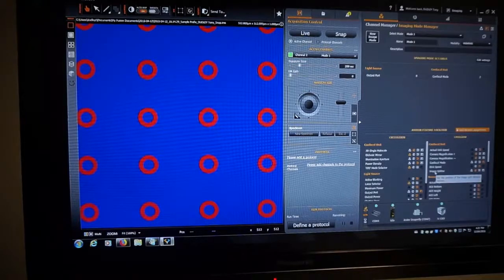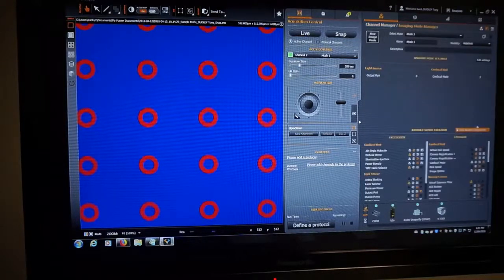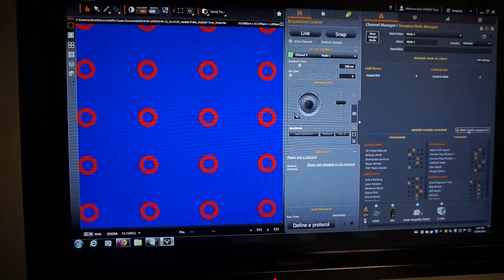And that will make sense when you go to actually set up a Dragonfly for the first time. The image splitter should be associated with a channel because the channel also tells you which camera is part of it as well. Okay, so when you create those default channels, it gives you both the Zyla and EMCCD camera versions of the channel if you have those two cameras connected. Okay, so I think that makes sense. Okay, so you can lock that again.